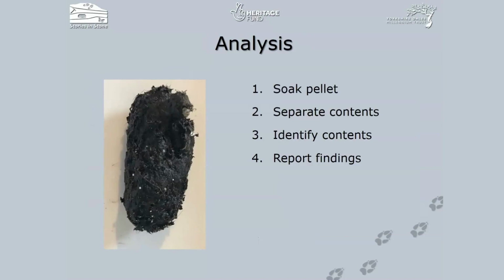So what I'm going to follow this up with is some video footage that will go through the next few steps. So soaking the pellet, separating the contents, and then what we'll do is we'll come back to some photographs and the PowerPoint presentation to identify the contents.